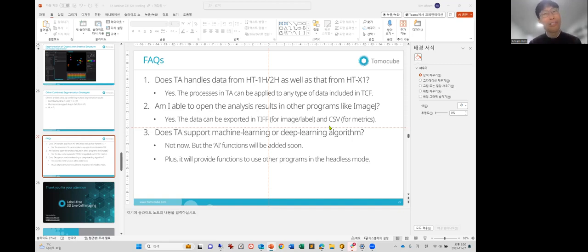The situation is very similar in fluorescence. When LDs are stained with fluorescence and are too small or too close to one another, it's very difficult to determine each droplet because the signals are mixed and it's hard to tell the boundaries.